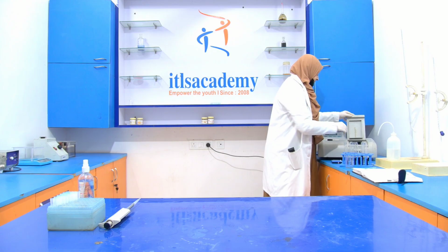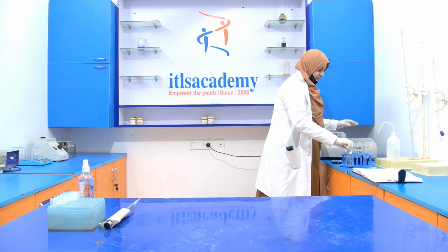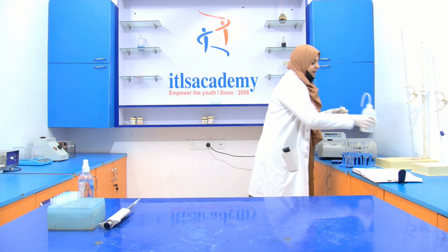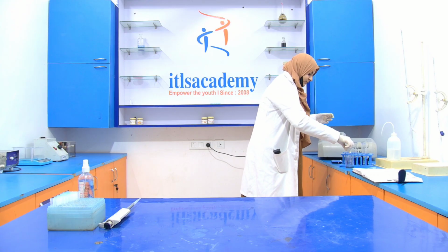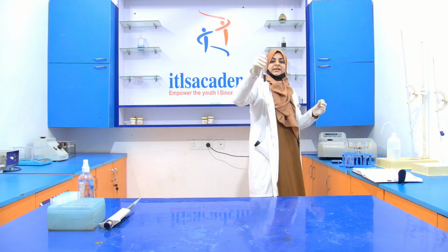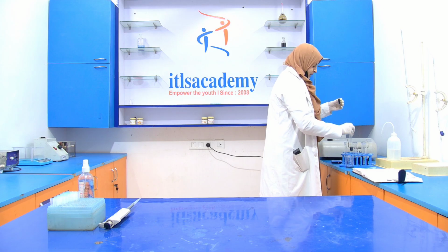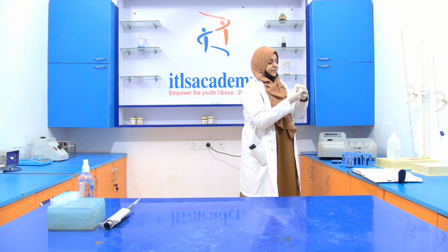Then take this out, discard this, then wash with the distilled water. Every time we have to wash it with the help of the distilled water. It is very important. Then take the 0.4 ml. Again, wipe it with the help of the filter paper.